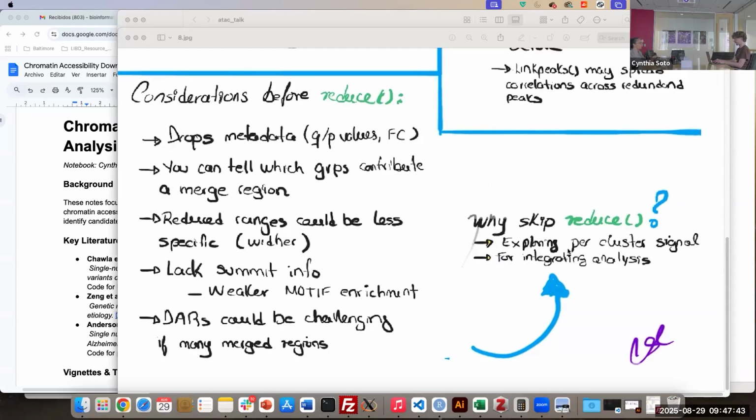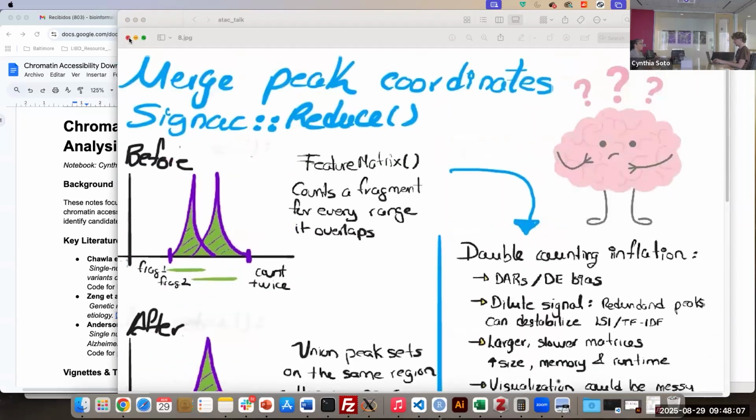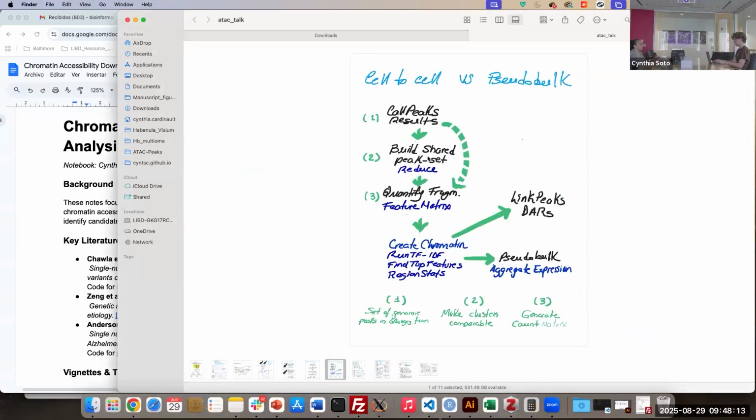So you don't need this merging information about the peaks or the same system of coordinates, because you are only exploring peaks. Also, this is very common when you are integrating with other kinds of data, let's say different datasets coming from different projects. These are reasons for the use of this strategy that I previously explained. So as I said, you can opt to make these shared peaks, but you need to think about the different conditions that you have to do it.